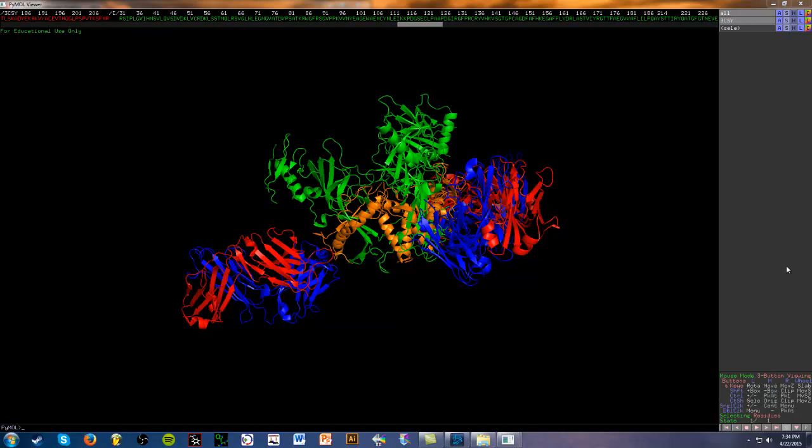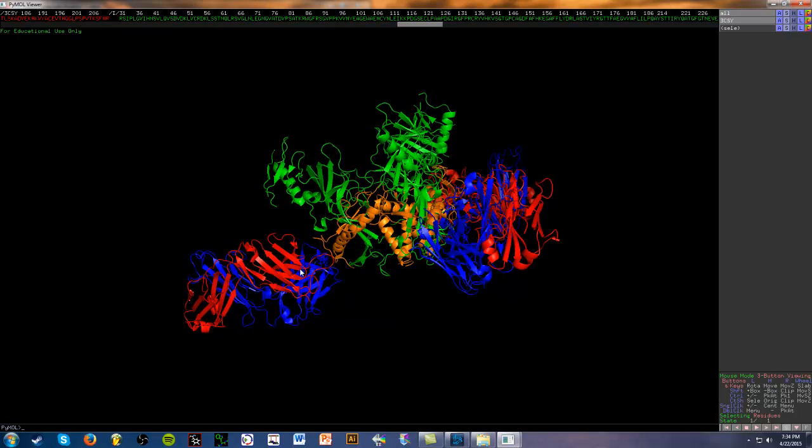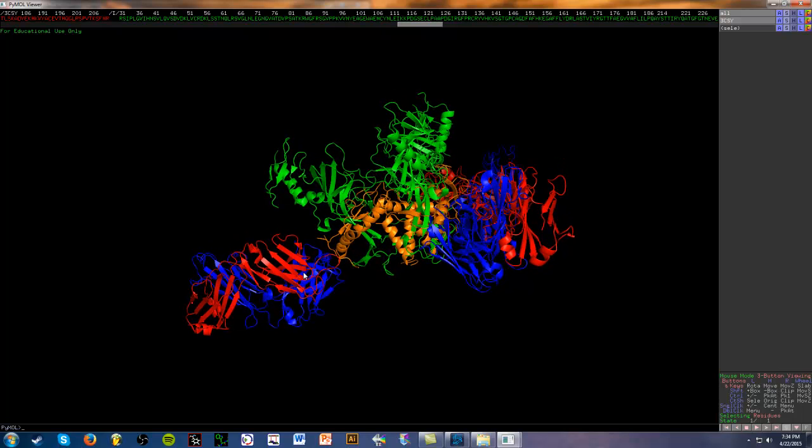We'll be using the same structure in the two previous videos, the Ebola glycoprotein GP1 and GP2 domains in complex with neutralizing antibodies, shown here in this structure. The green and orange are the GP1 and GP2 domains, and the blue and red are the antibodies, the heavy and light chains of the FAB region.